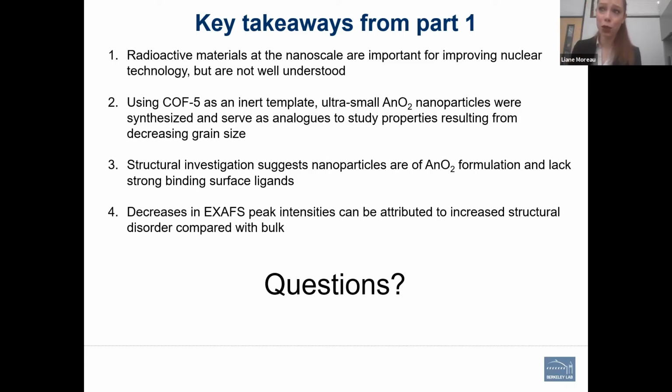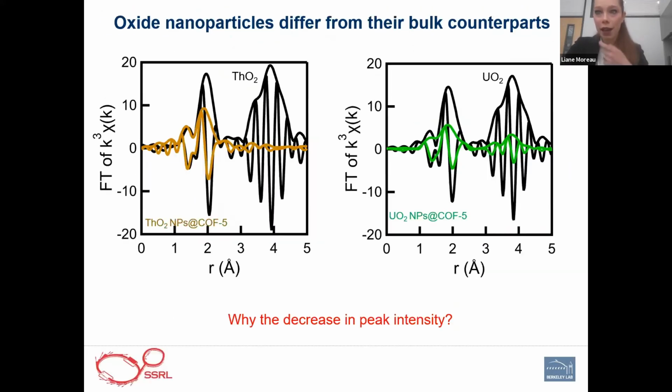It's actually really difficult to create uranium carbide. That was something that we looked into as a possibility, but we didn't really see any evidence for it structurally, and it actually would have been really cool if we could make that, but it didn't appear that we did. And then as far as fluorine, we did question, well, it does seem that there may be some residual fluorine. However, the level has greatly decreased in amount.